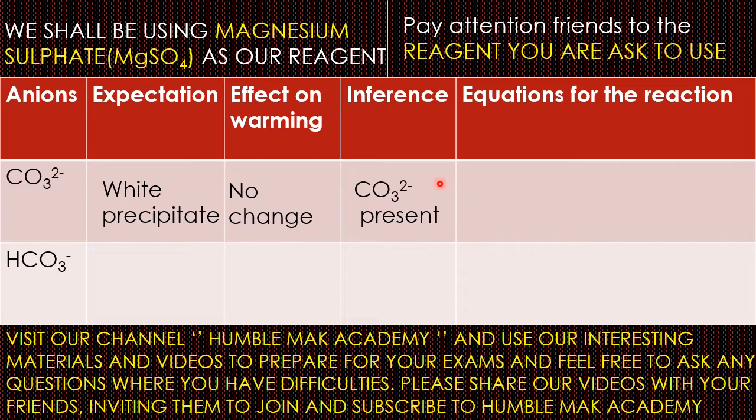Good. Then now guys, the equation for the reaction. In this, our reagent of interest, the one that is actually going to give us the white precipitate, is this magnesium 2 plus, the magnesium ion that is going to react with the carbonate ion. So guys, the equation for the reaction, we are going to have our magnesium 2 plus reacting with the carbonate ion to give us magnesium carbonate.